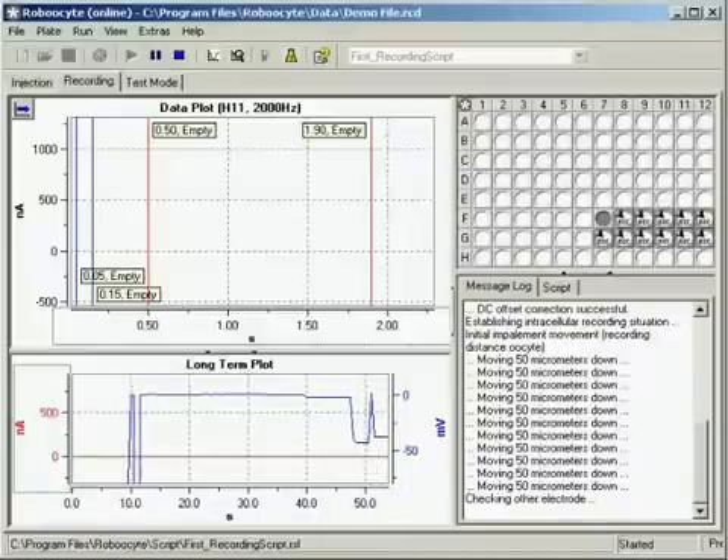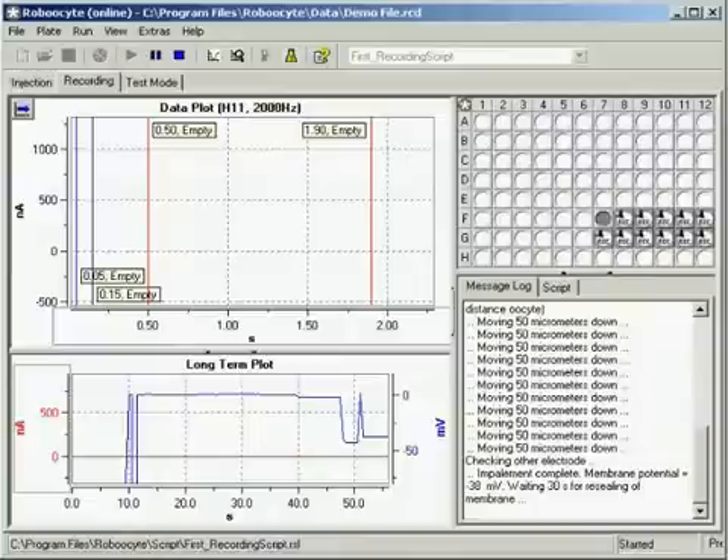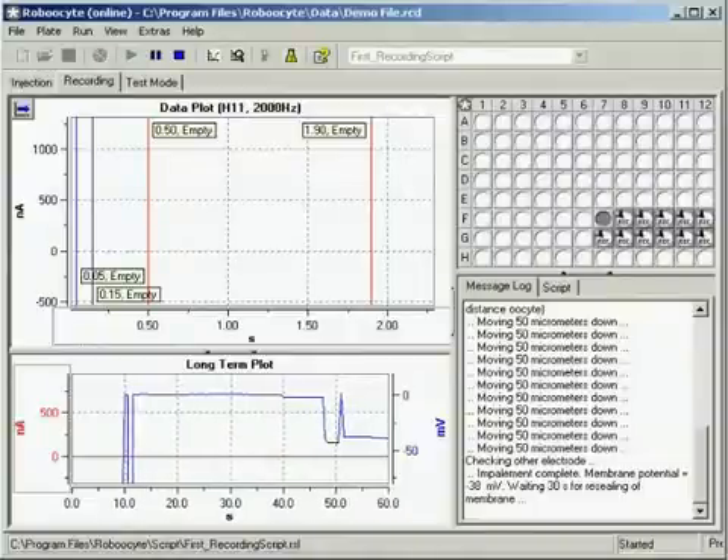The recording protocol is performed automatically for up to 96 oocytes. The screenshot shows a typical response from a nicotinic acetylcholine receptor. The two blue bars define the baseline and the red bars define the region of interest.